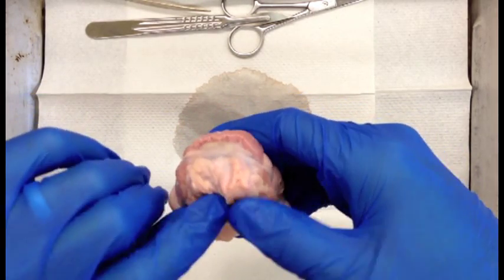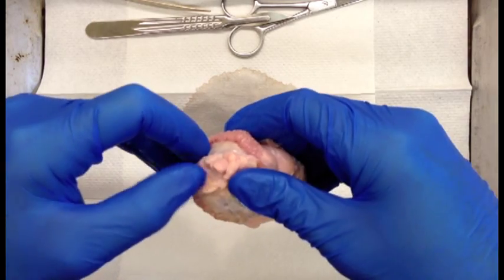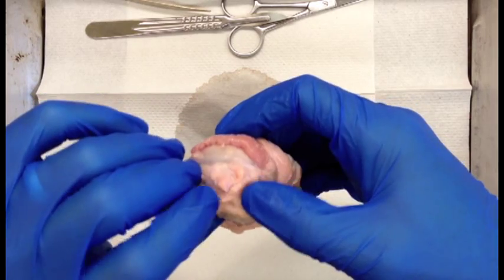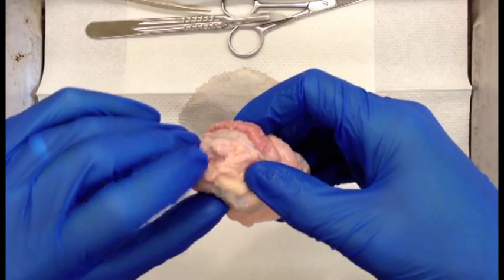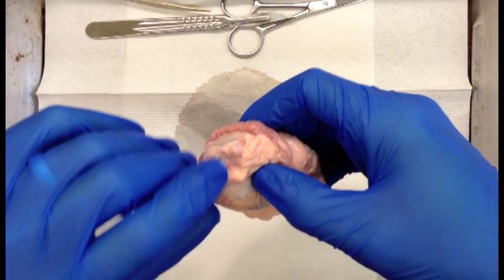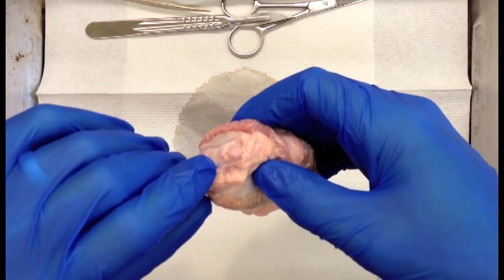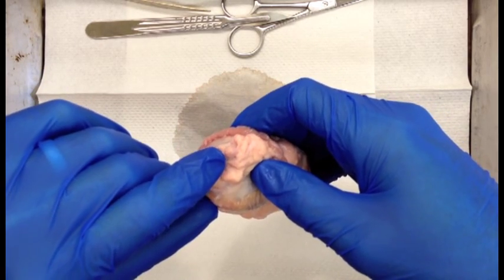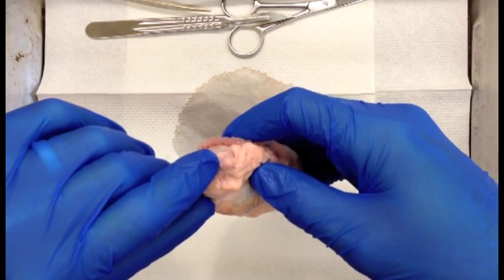And if we look in here right in the center, you can see this sort of cream-colored, almost tube-looking thing sticking out. And this right here is the optic nerve. The optic nerve is what connects essentially the eye to the brain. So all the electric impulses that come from the retina, which is inside the eye, those electric impulses will be sent through the optic nerve to the brain.